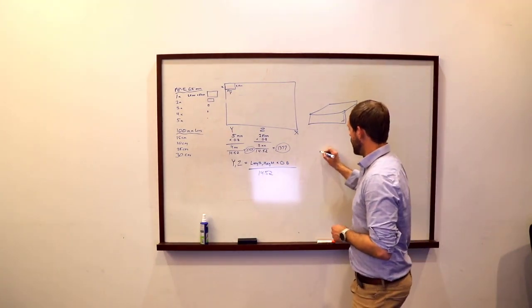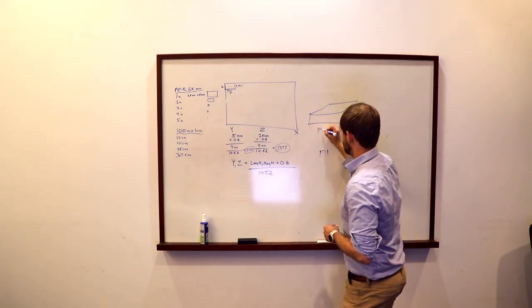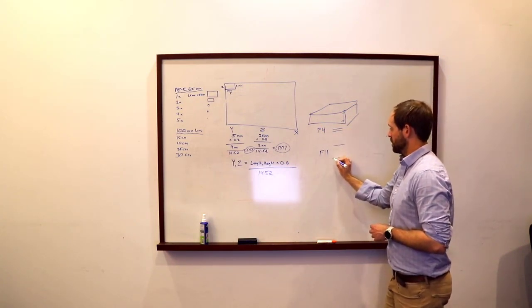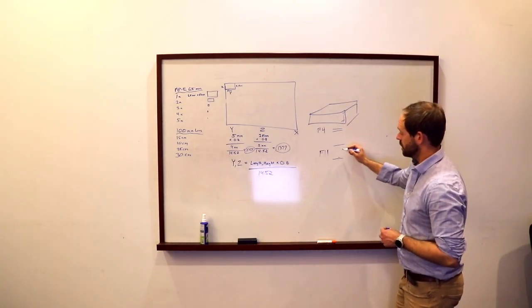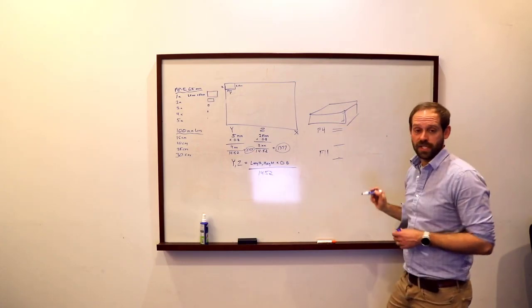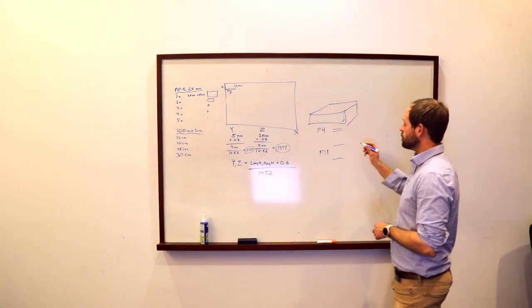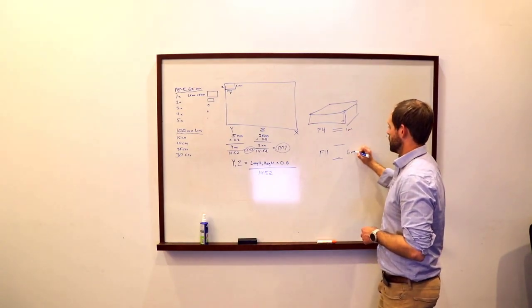So, if you have an aperture, for example, f11 versus an aperture of f4, at f4 your focal plane, so the depth, is going to be really shallow, whereas at f11, your depth of field is going to be pretty deep. However, you start to compromise lighting, and you start to compromise quality at f11, whereas you don't so much at f4. You just have a very narrow depth of field, so the time it takes to capture images is significantly greater. So this might be 1 millimeter, this might be 6 millimeters.